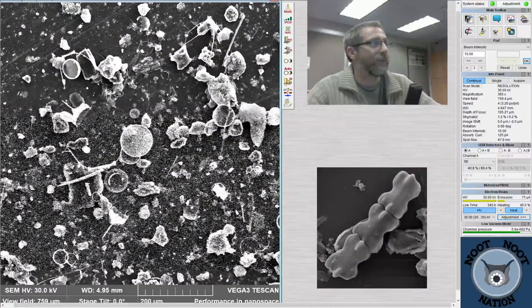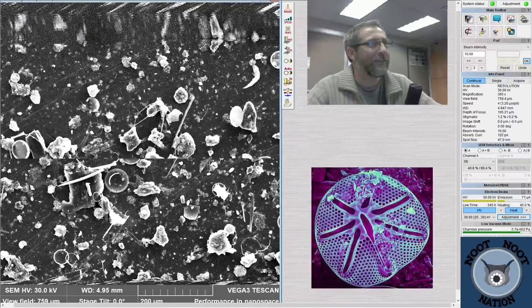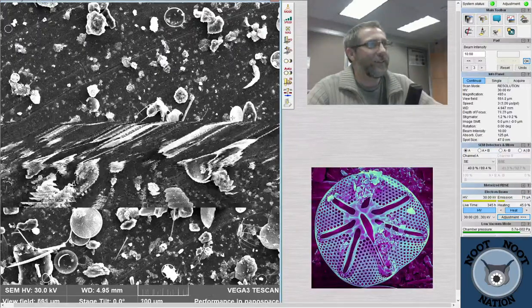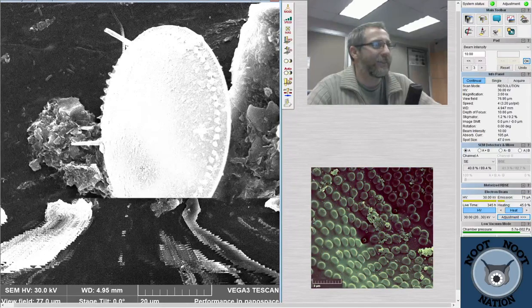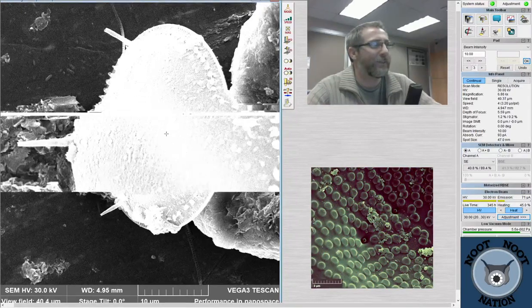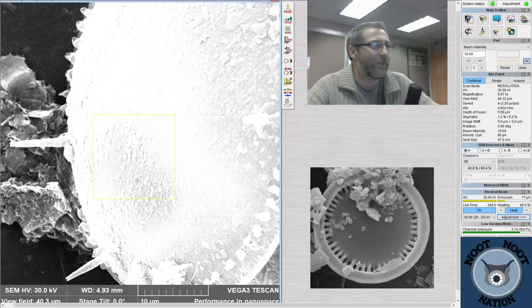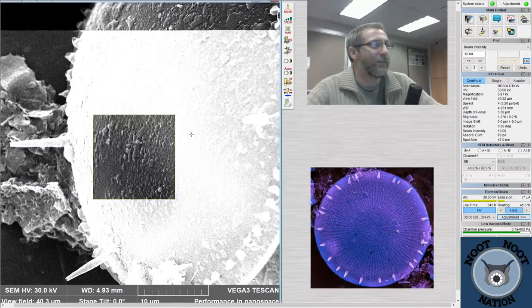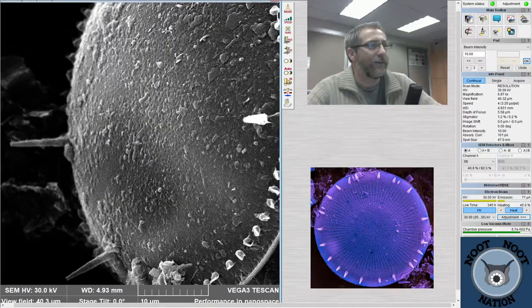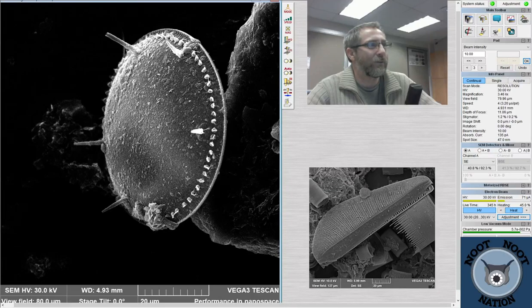There's actually a ton of samples that I can make from the amount of material that Pacific Plankton sent me. She sent me like a giant vial of plankton, and there's enough material in like a tiny little piece of it to make samples for ages for us. So I just used it to try to make a bunch of samples for today's stream. I don't study San Francisco Bay diatoms, as I mentioned. Today's just sort of like a fun stream for us. We're not necessarily looking at a specific organism for a specific purpose. So these are pretty cool.